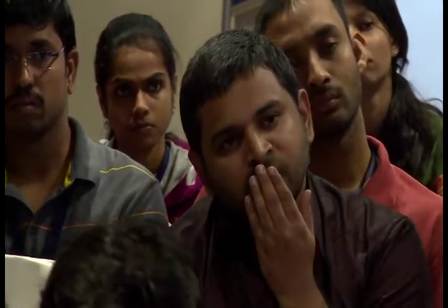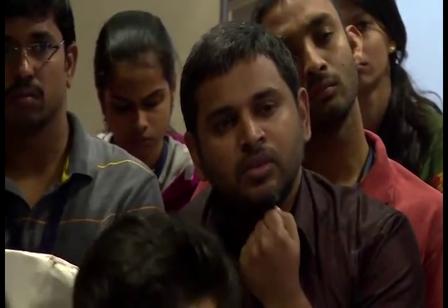What that program does is you give a PDB or an MRC format, and then you input the parameters which you want to use in a microscope, say pixel size, voltage, number of electrons, and the defocus value. Then you can project that particular map into different projections, and it gives an idea of how your particles should look in a micrograph, in a microscope. But the problem is that it's very difficult to get the parameters of the detector very accurately, and that's one of the things which we find very difficult in that program. Thank you.